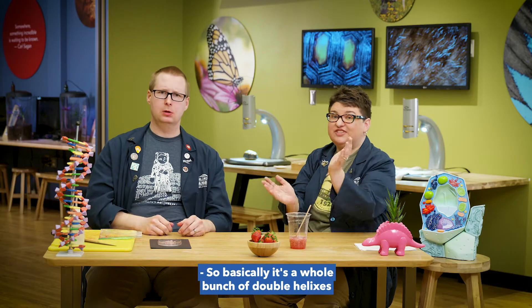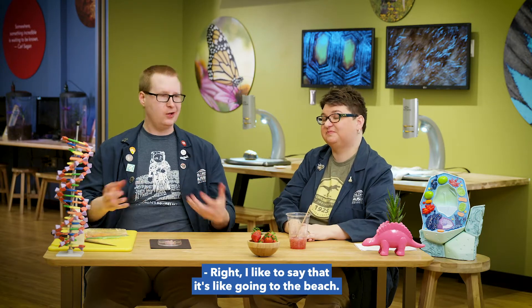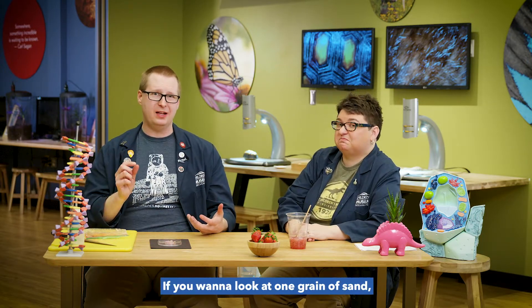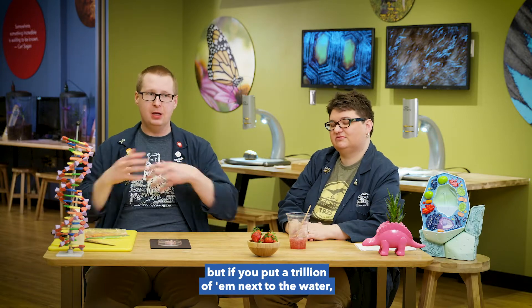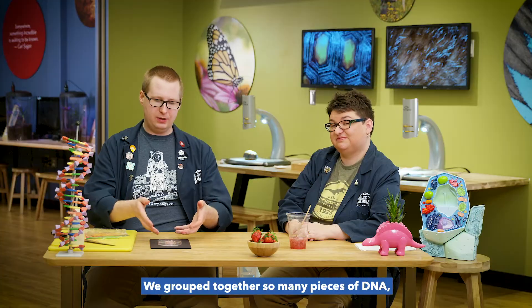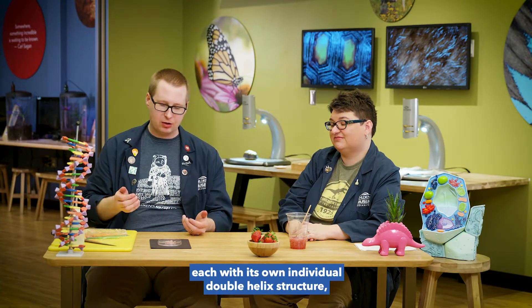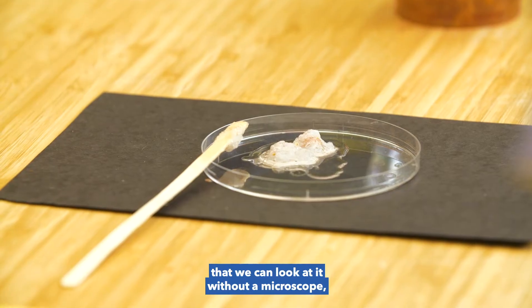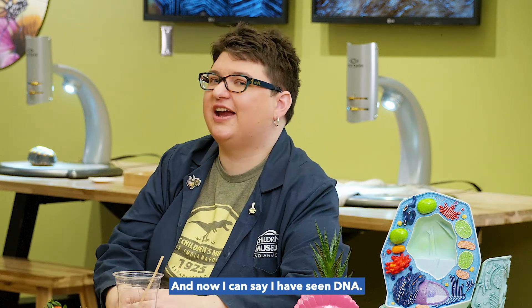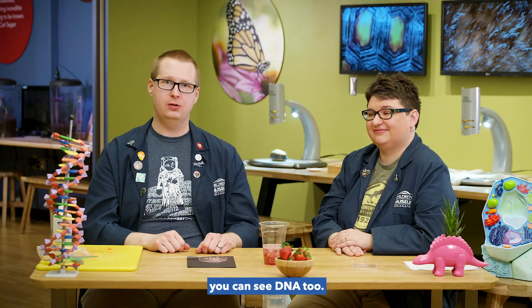It's a whole bunch of double helixes folded over on top of each other. I like to say it's like going to the beach — if you want to look at one grain of sand, it's kind of tough because they're really, really small. But if you put a trillion of them next to the water, you call it a beach and you can look at sand all day. We group together so many pieces of DNA, each with its own individual double helix structure, that we can look at it without a microscope, without even a magnifier. That's so cool. And now I can say I have seen DNA. If you do this at home or in the classroom, you can see DNA too.